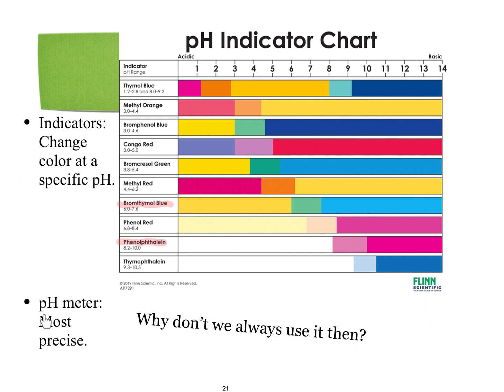Now, the last one we're going to talk about is the pH meter. It's more precise. In fact, it's the most precise. It can read pH to 2 places past the decimal, sometimes even 3. And you might be saying, well, if it's the most precise, then why don't we use them? Well, that precision comes at a price, literally. They cost a lot of money. Fortunately for you, we've collected enough pH probes, which are also known as pH meters, over the years to have a fair amount of them to use for class, but they are electronic, so they run out of batteries.